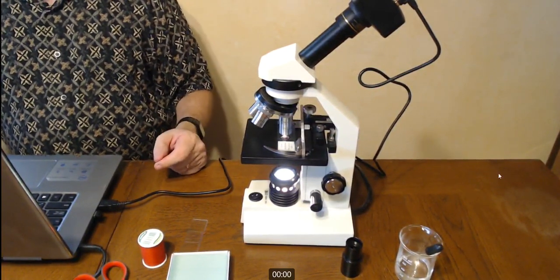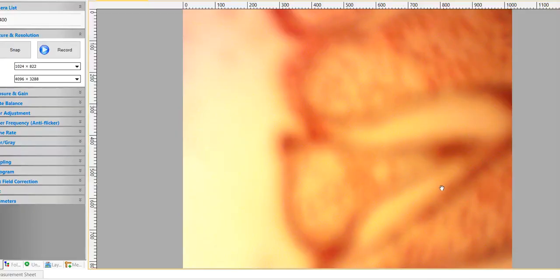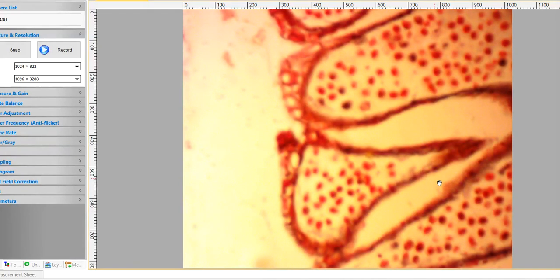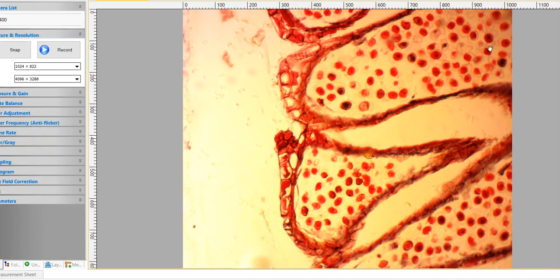Again, we wanted to make sure that what we had in focus was in the center. So if I go back to my thing, now we're a little out of focus. Turn one way, it gets blurry, so go the other way. Seems like I always pick the wrong direction. But now we should be able to bring it into focus. Okay, now we're seeing some detail here. Oh, that was interesting. There we go.